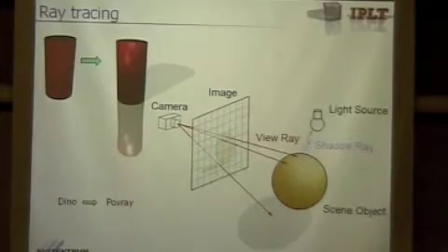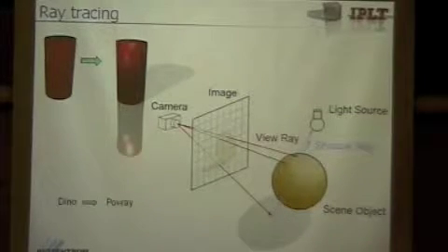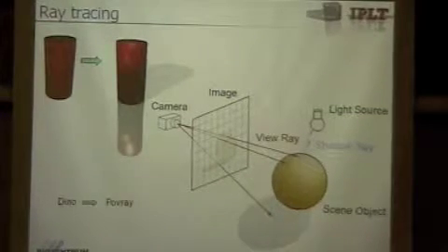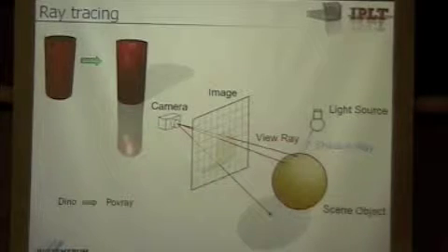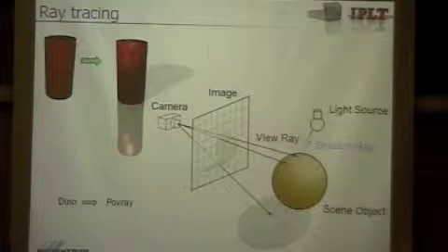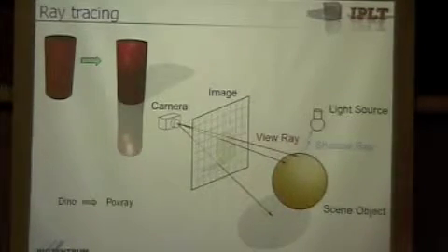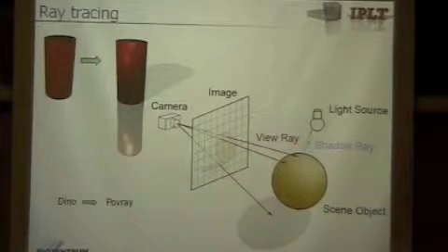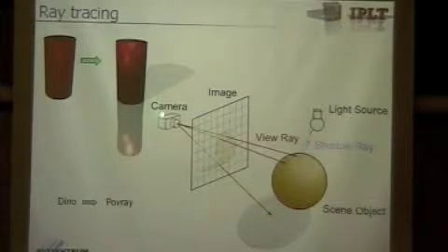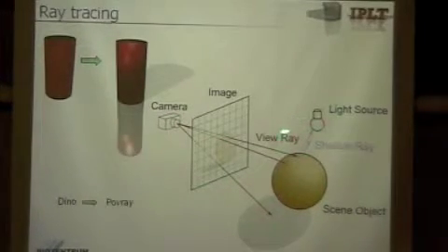Okay. Then there is even a nice way to do that. Once you have your surface, you can apply it to a ray tracer. A ray tracer basically simulates the way the individual rays of light travel. It starts from the camera, goes back and sees what objects are hit, and which light sources are hit.